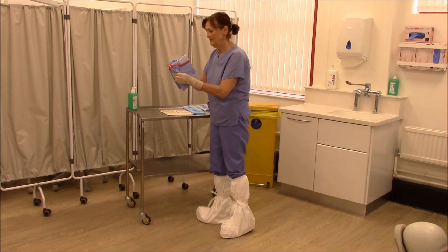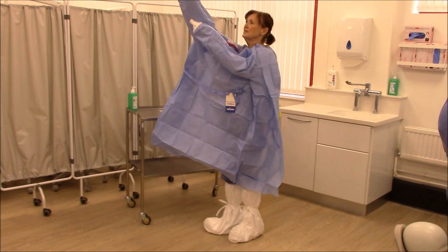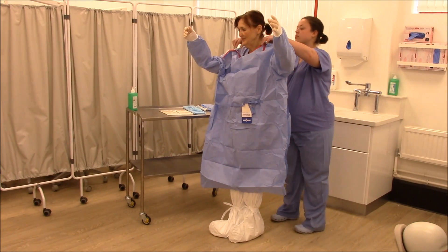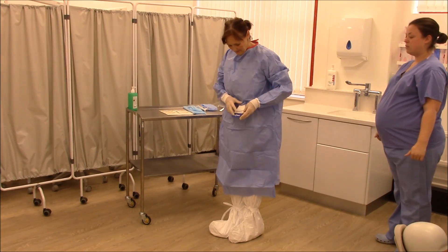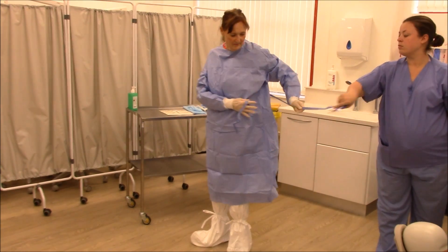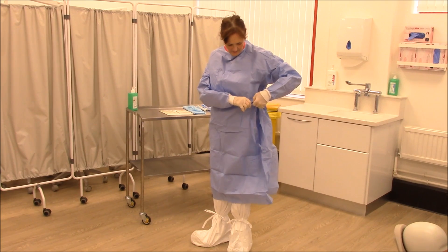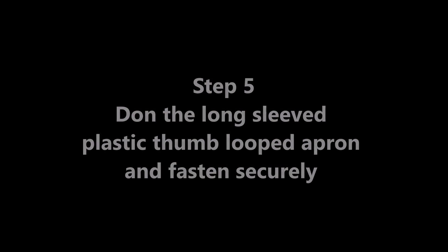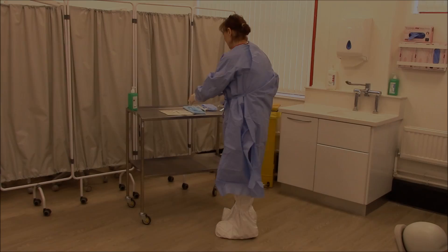Don the surgical gown over the gloves and fasten. Don the long-sleeved, plastic, thumb-looped apron and fasten securely.